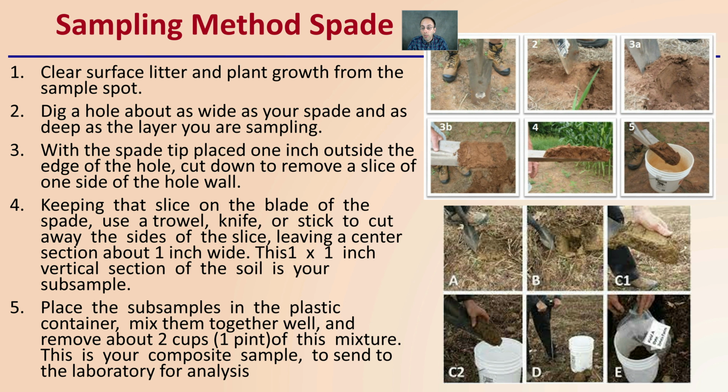All right, so here I am in the field, and I'm going to go over how to take a soil sample with a couple different methods. Now the goal is going to be the same. The end result is going to be the same amount of soil, field representative. While I'm in a large cornfield here, I'm going to show you an area at one point, but we'd be replicating this soil sampling technique throughout the entire field to get a representative sample.